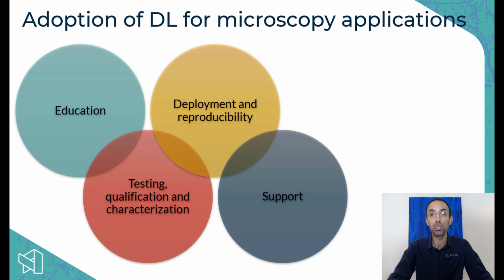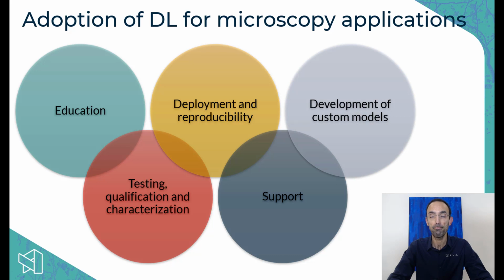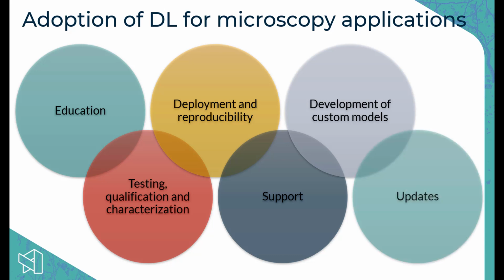We do provide full technical support to the models that we deploy within Aivia. So these are professionally supported by our team, and that provides you some security. We are continuing to develop these models, and we are happy also to help you develop additional custom models. So that is something that we also provide. And as we develop new models or update the old ones, we will be replacing the old ones with the new ones, so that you can always use the best quality models available.